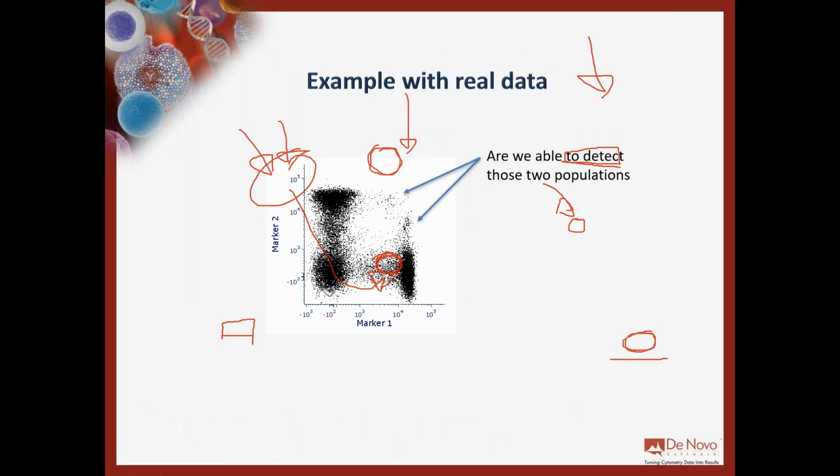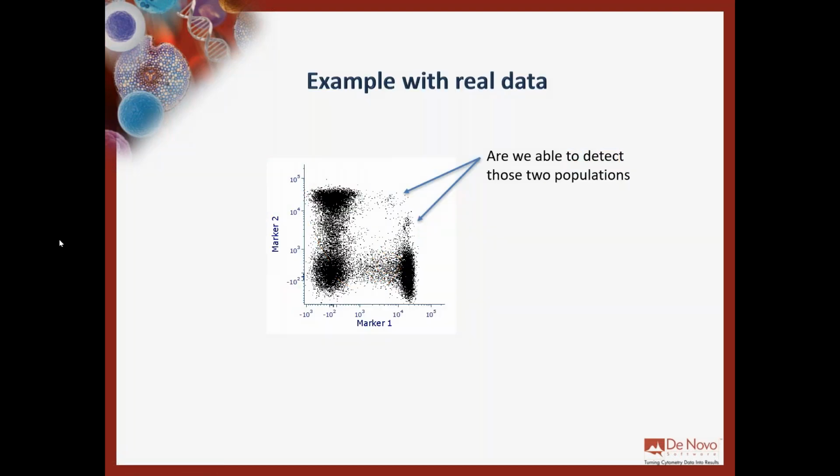So this was a fake file, and you might say, well, this is a fake file, it's not a real file. Is this working also with a real file? This is another, real file. It's a very basic file.